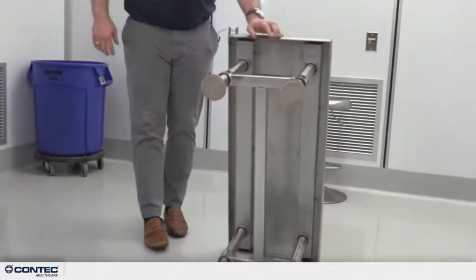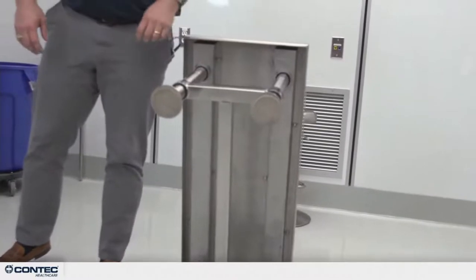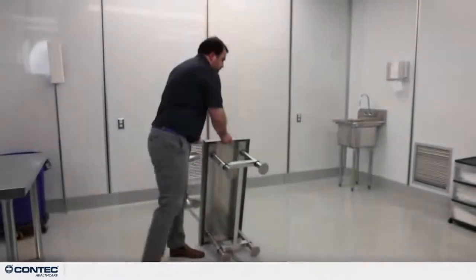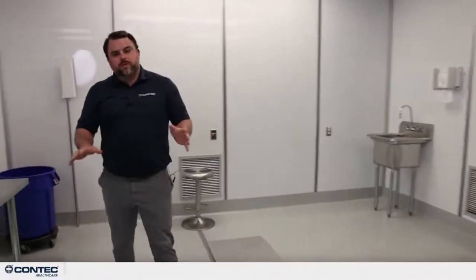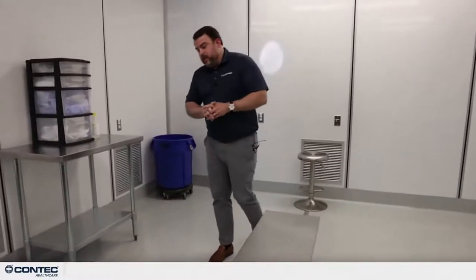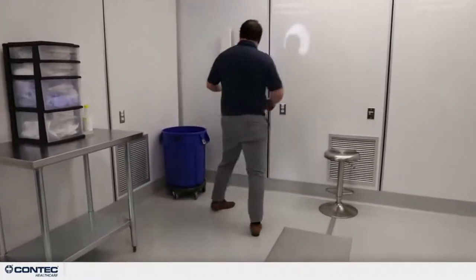I've seen in some facilities where the top is appropriate, but the bottom may be of a galvanized steel type deal. So over time, potential harbor points there. And also with your floors, easily cleanable surfaces. You don't want something with too much friction. You want something where you can easily deliver the disinfectant to the floor, it maintains its dwell time and kills what it needs to, but also so you can do the proper swivel S motion.